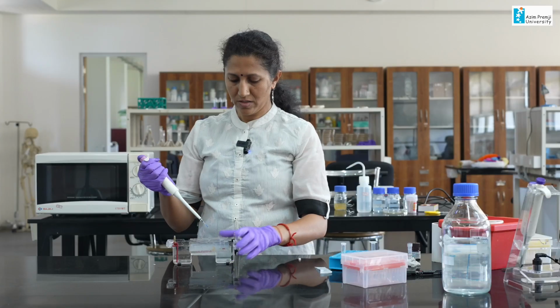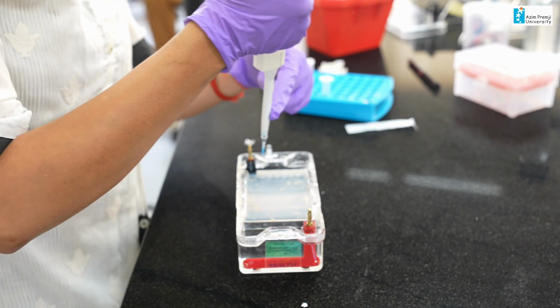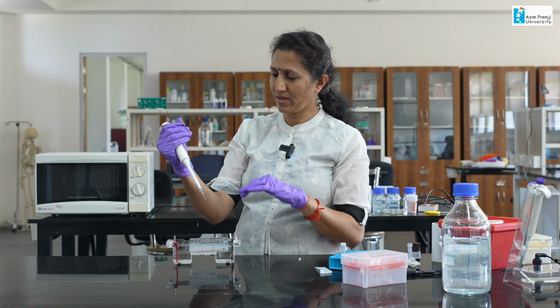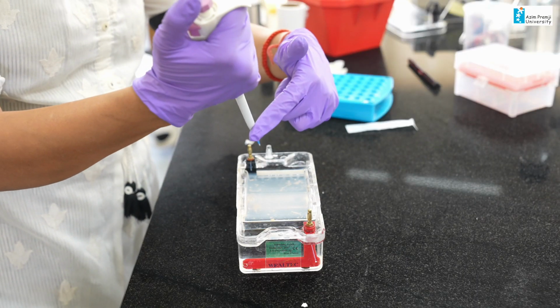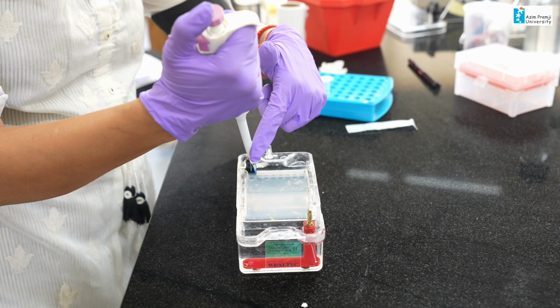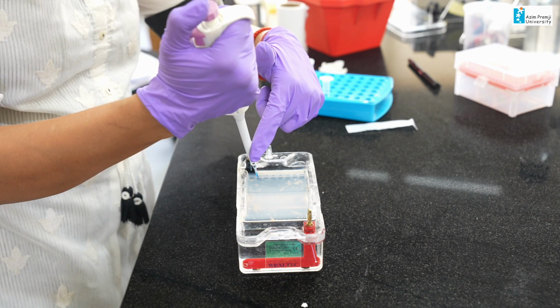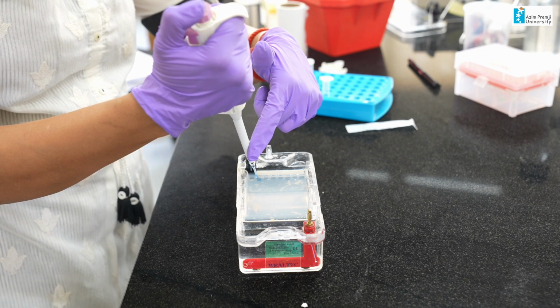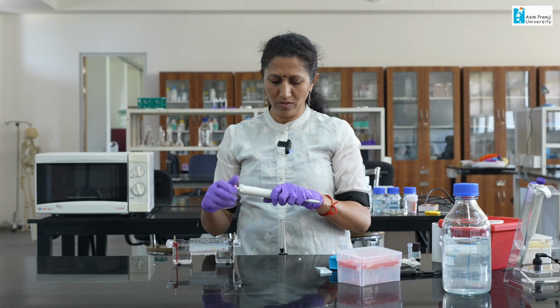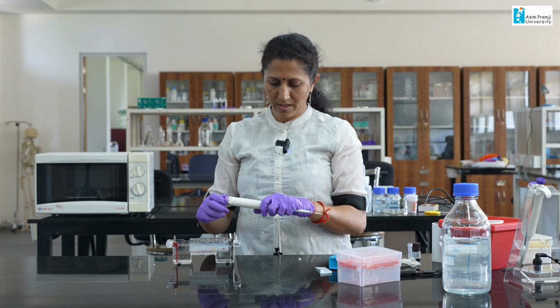Okay. So, you can see the wells clearly here and the gel. So, I am going to load. You have to hold the pipette in this way and then grip your finger, it will be easy for you to load. You can see the well also clearly, and slowly release the sample into the well.